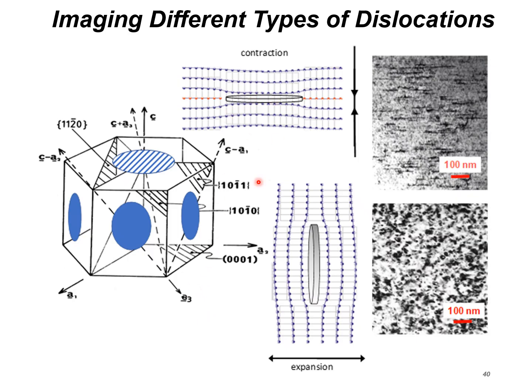This describes loops in hexagonals. Typically in hexagonal, in zirconium in particular, you get loops possibly on basal planes or on the prism planes. So this is the hexagonal prism here, and you get loops on this plane or on this plane. But what happens in zirconium, for instance, is that these loops tend to be vacancy in nature. And they would show up when you're imaging, looking parallel with the basal plane, as little lines, because you're looking at them edge on.